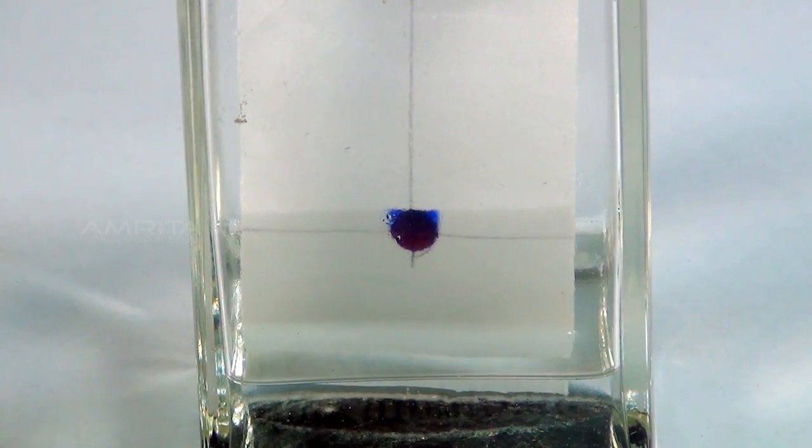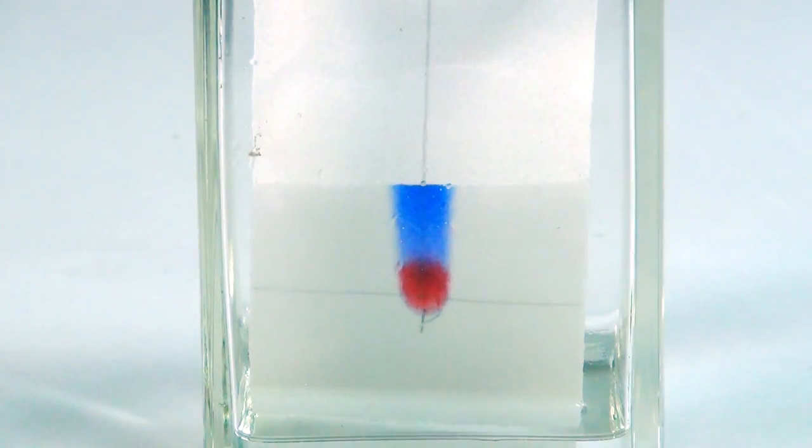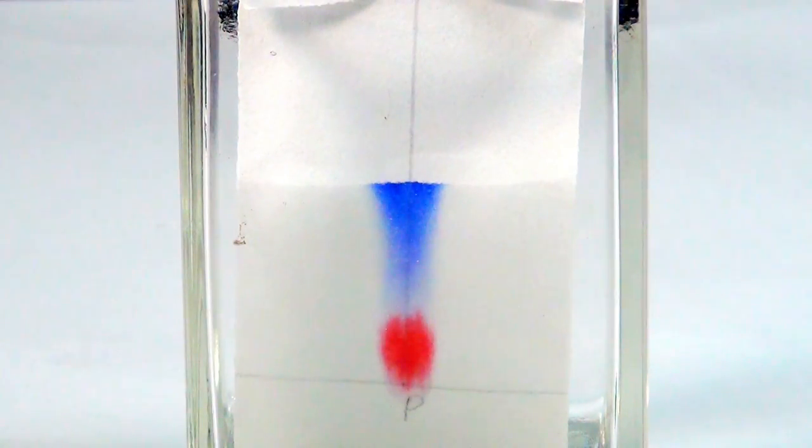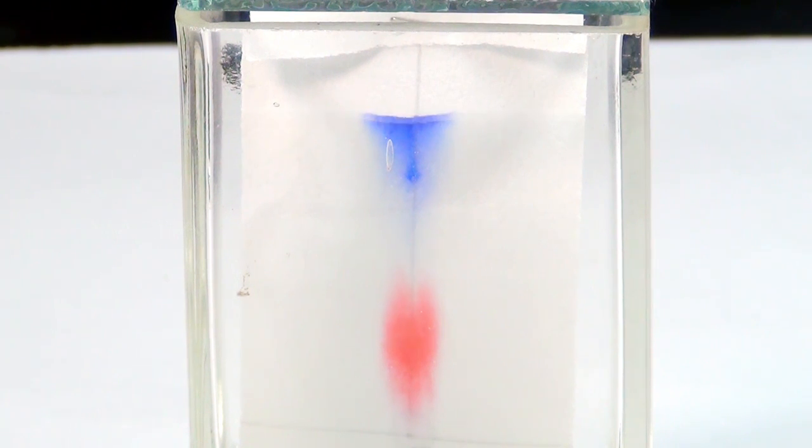Keep the chamber undisturbed for some time. Notice the rising solvent along with the red and blue inks. After the solvent has risen, you will notice two different spots of blue and red colours on the filter paper.